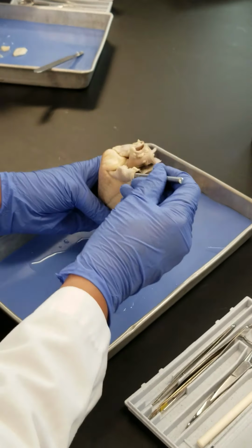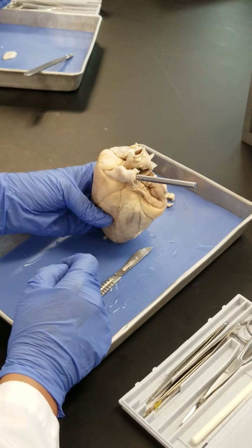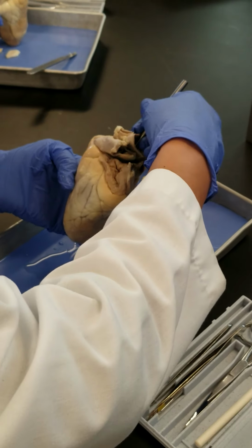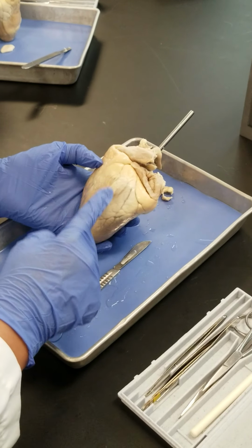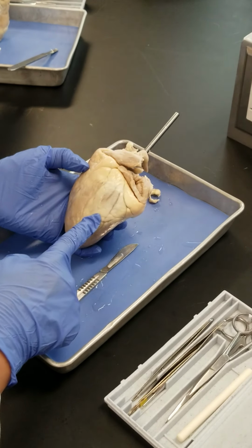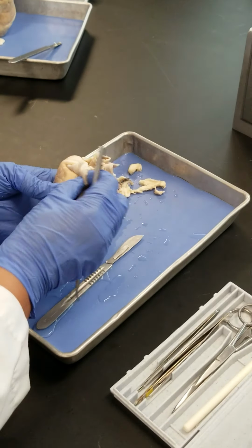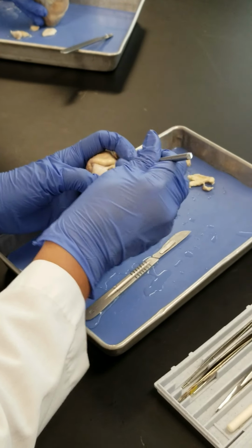Now behind this pulmonary trunk, you see another artery. What should it be? Aorta. When you put this probe inside and you continue that, you see that it's coming out of the left ventricle, right? And you can see the direction of that here, right? It's coming out of the left ventricle. That is the aorta.